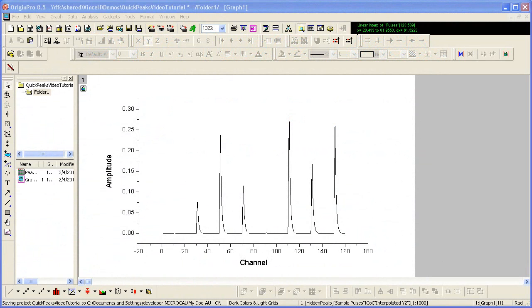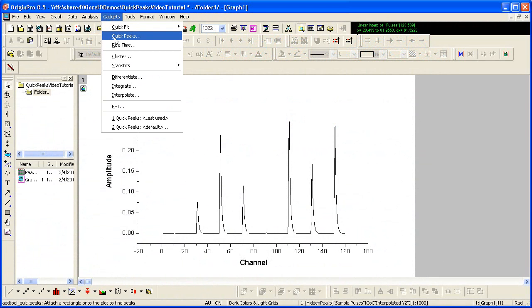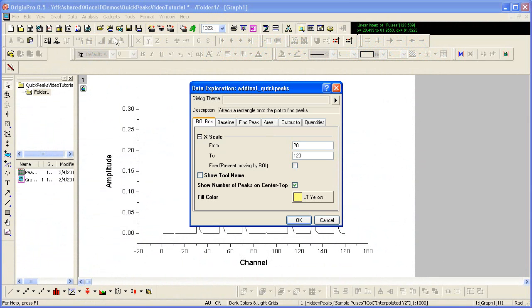To open the gadget, make your desired graph active and select Gadgets Quick Peaks from the origin menu.